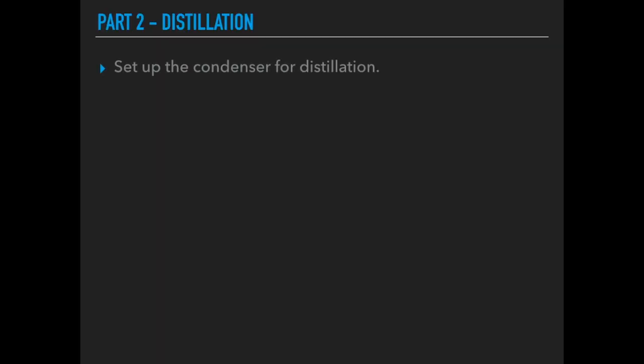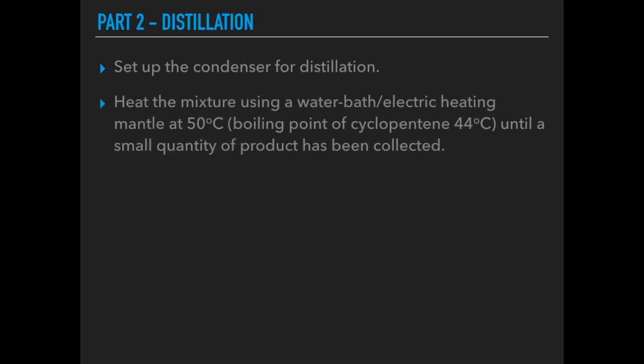Moving on to part two, the distillation step. Set up the condenser for distillation and heat the mixture using a water bath or electric heating mantle at 50°C. The boiling point of cyclopentene is 44°C, and there is also water in the flask produced during the reaction. Keeping the temperature to around 50°C means the cyclopentene should distil over while the other substances, including the water, remain behind.